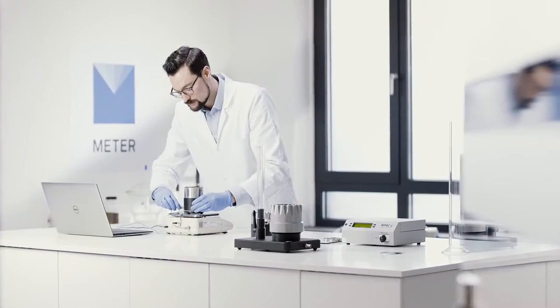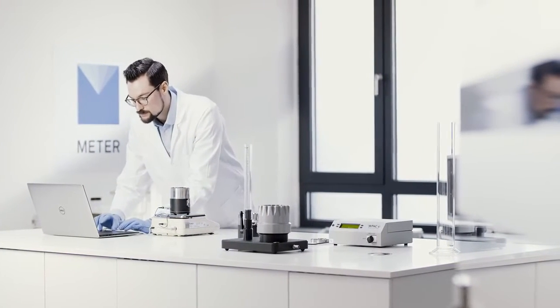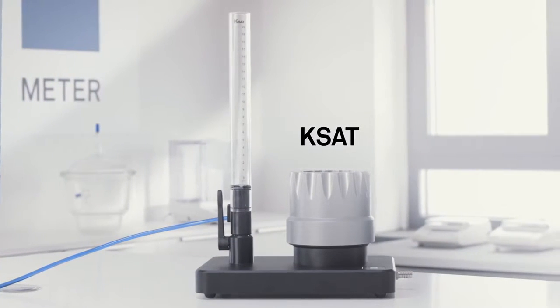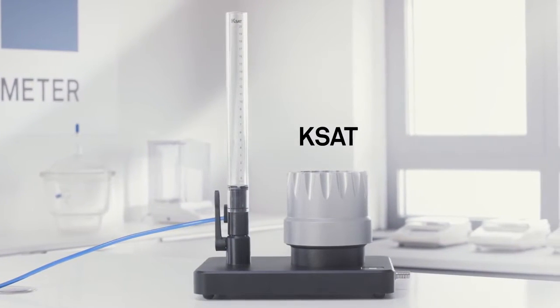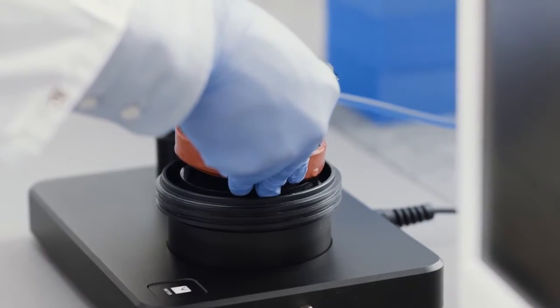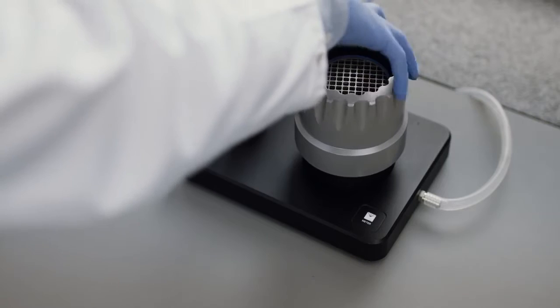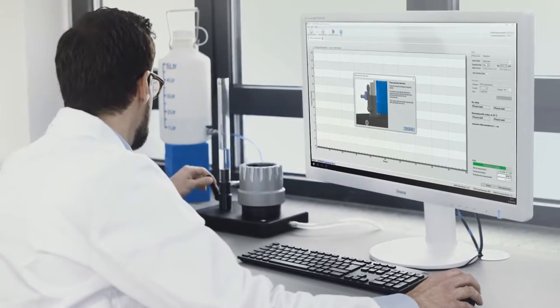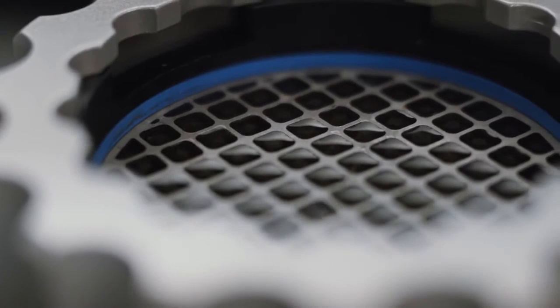This is how it works: prepare the sample, put it into the calibrated KSAT, and tighten the cap. Turn the valve, let the water run through the sample, and get the saturated hydraulic conductivity.